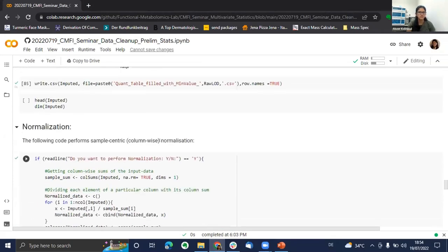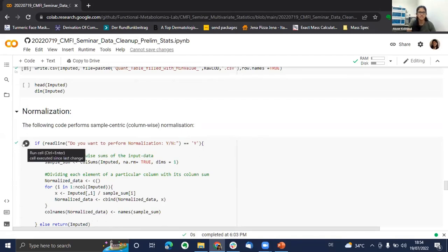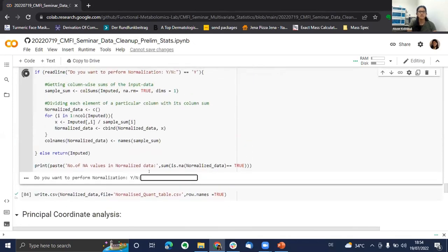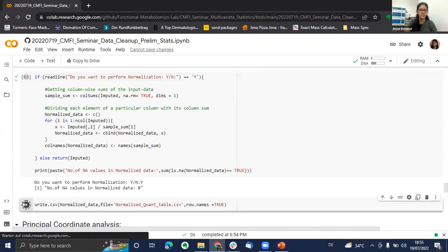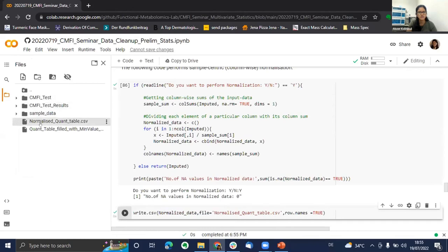For normalization in R, I just run the cell. It asks: 'Do you want to perform normalization?' I say yes. It confirms there are no NA values in the normalized data — it's done. You can also save it, and the output file is now visible in the folder. All three steps — blank removal, imputation, and normalization — have been completed and saved.